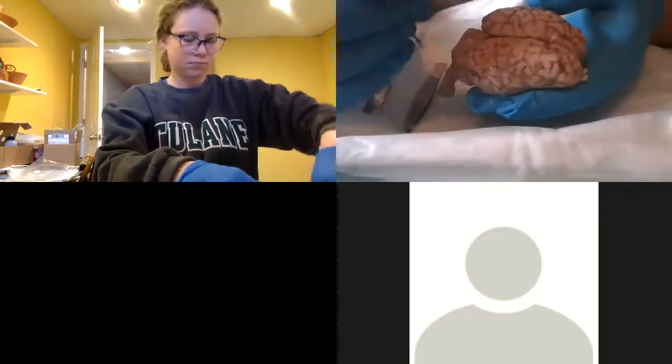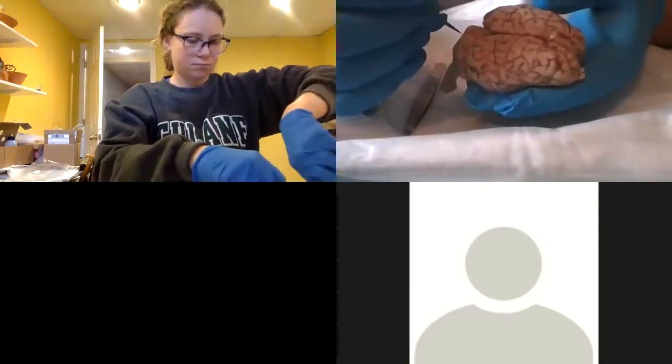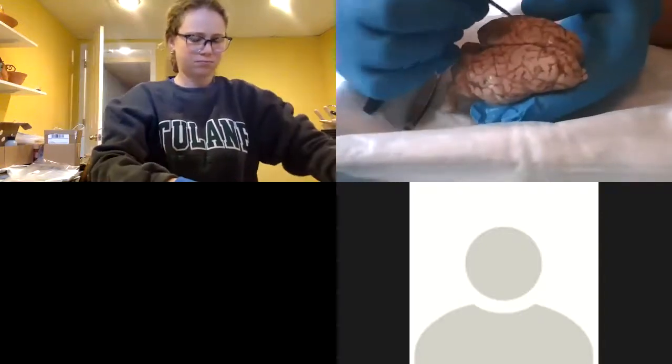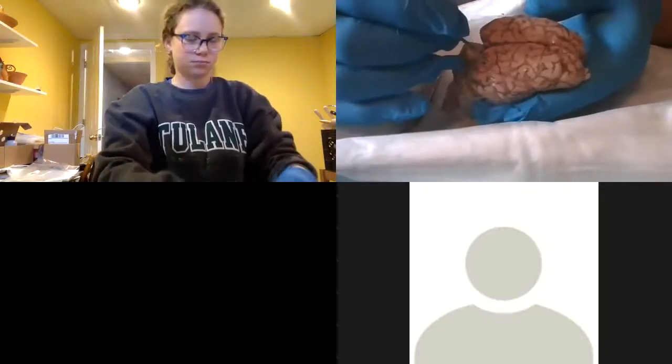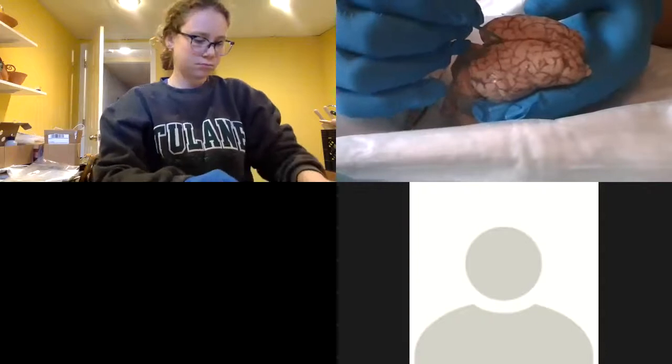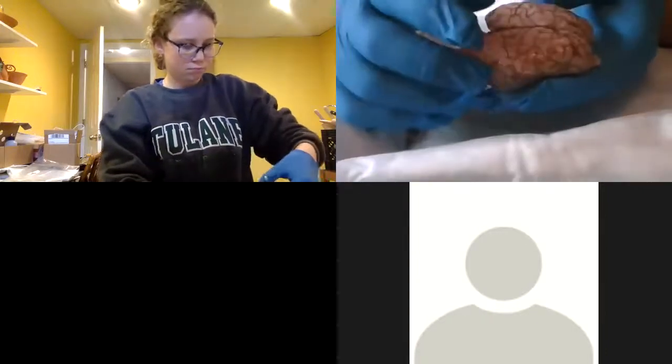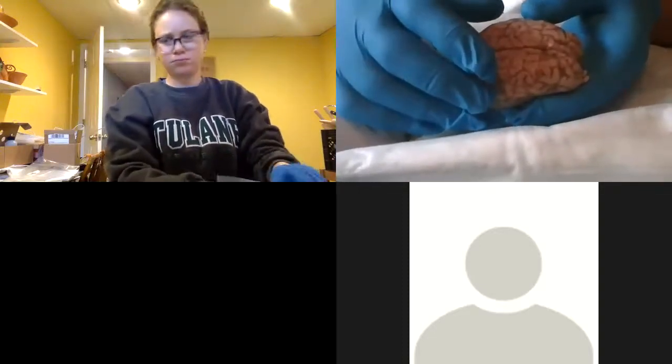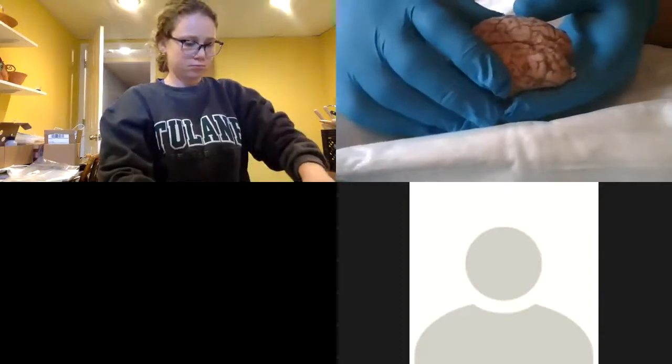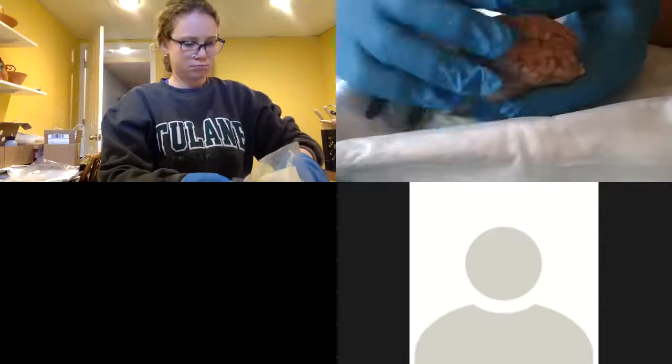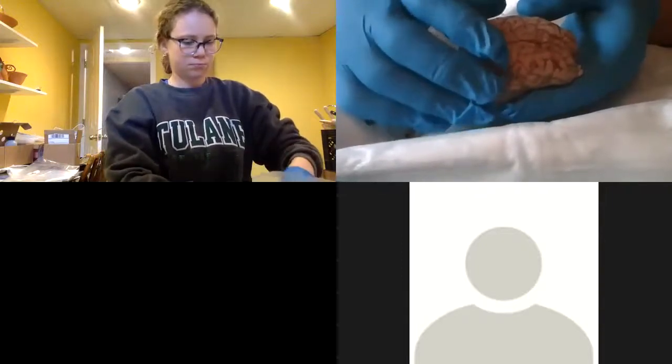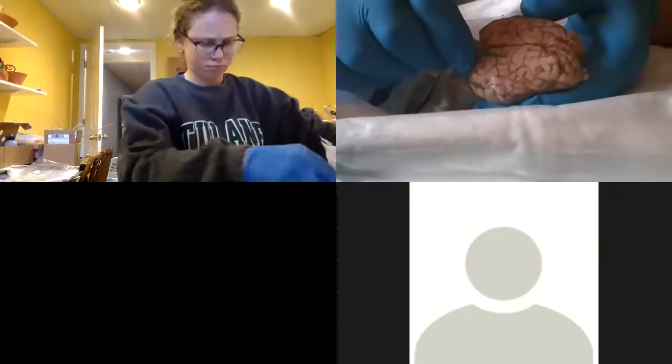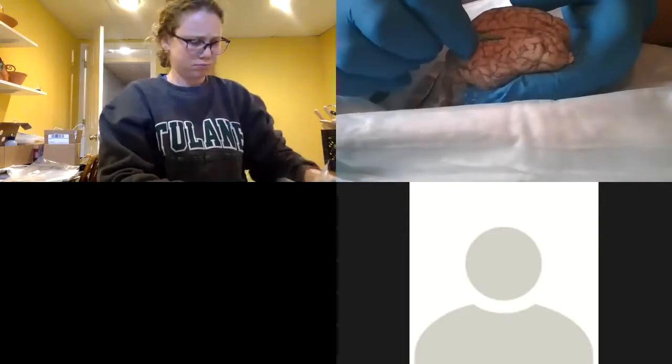Just speak out if you can't see something, because I really can't see the screen so good. So you could see the right and left cerebral hemispheres, the cerebrum, which is the largest part of the brain. And you could see the longitudinal fissure. Now, in some dissections, you'll have the dura mater and the arachnoid mater are together. So that is not on this brain. All we have is the pia mater, which is right on top of the brain. You might be able to pinch some of that off if you go in there.